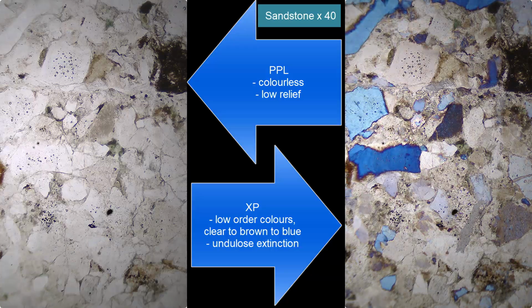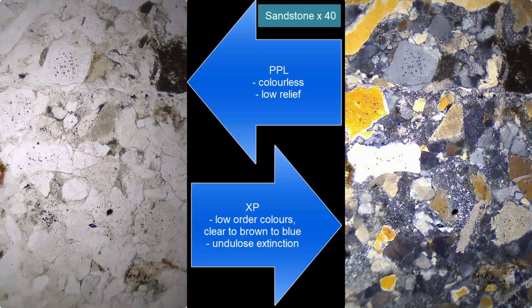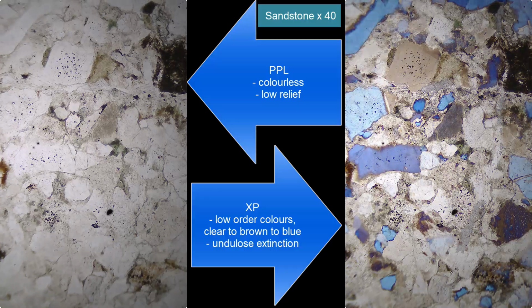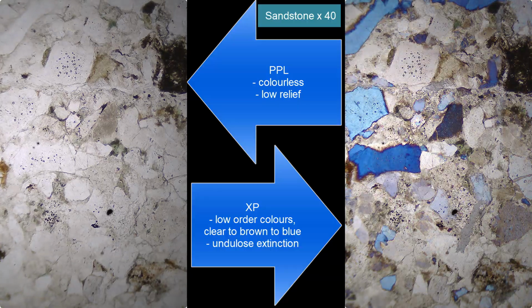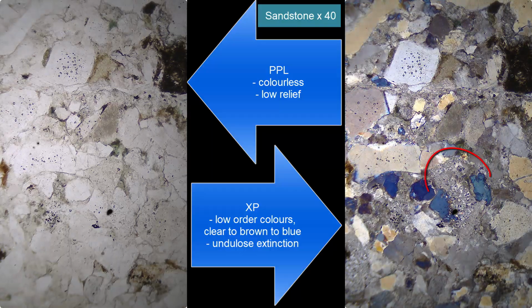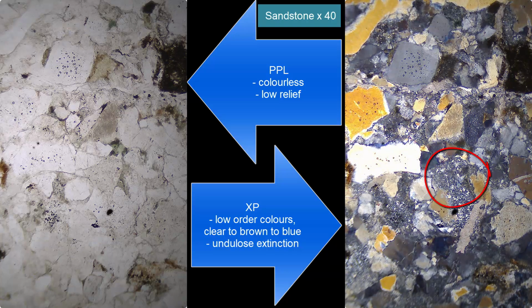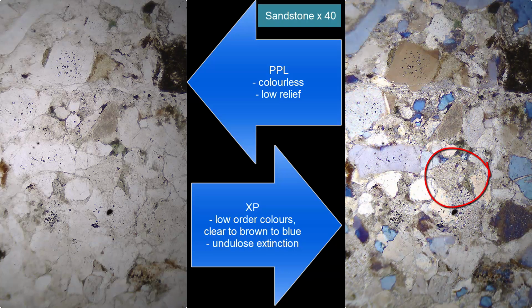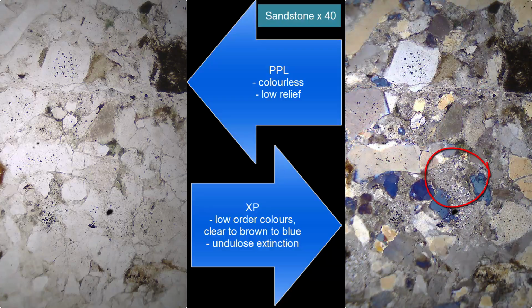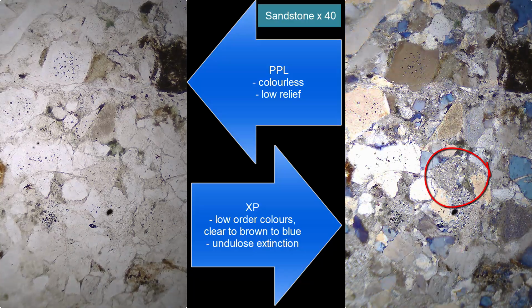And so the second sample of quartz here is sedimentary. You can see that the quartz is now in rounded little grains. The reason I put calcium carbonate first is because you can now hopefully appreciate that it looks like the cementation between the quartz minerals is calcium carbonate, because they're fuzzy. And the other big difference between quartz and calcium carbonate is there's meant to be high order colors. And in XP there are some purpley reds if you close up on it, so it could be calcium carbonate.